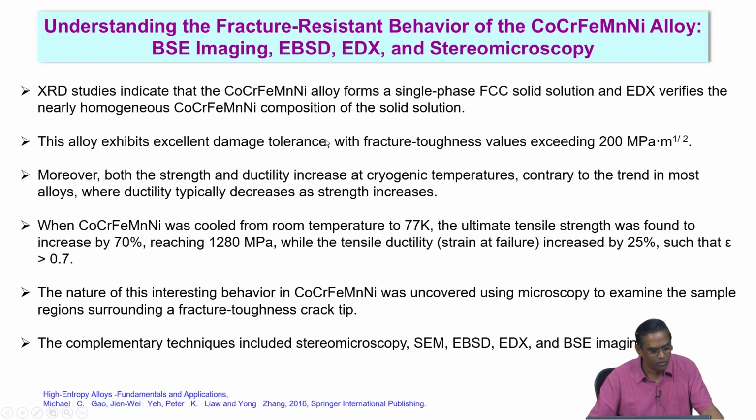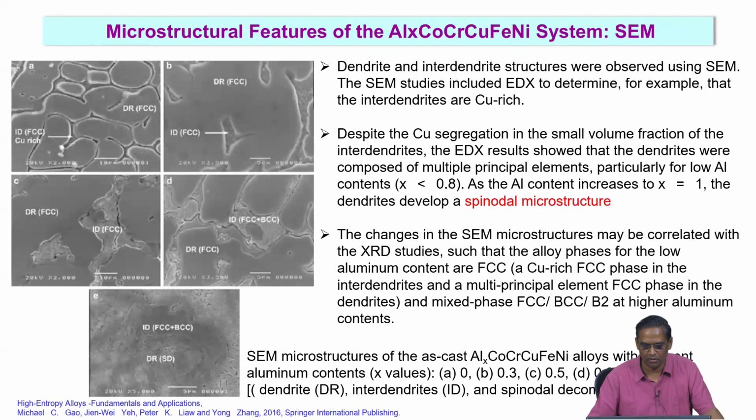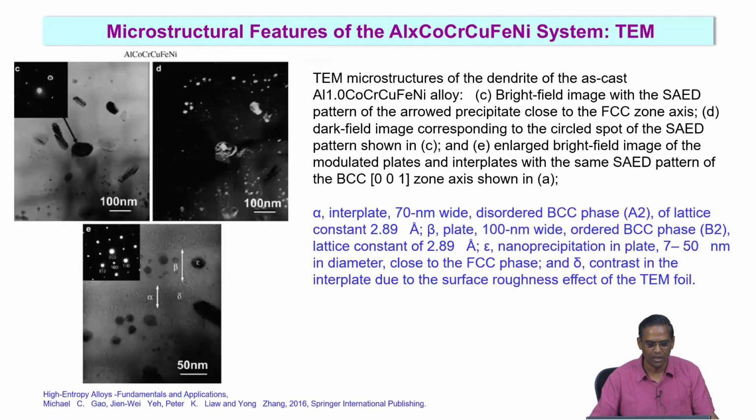EDX, we have been using EDX. I think I did not mention that, and I did not show that. I just mentioned the EDS results showed what the dendrites were composed of. I did not show that spectrum here, but the primary focus was to compare the X-ray diffraction, electron diffraction, SEM morphology and TEM morphology, phase evolution. Of course, EDS we have used. I didn't bring that spectrum.